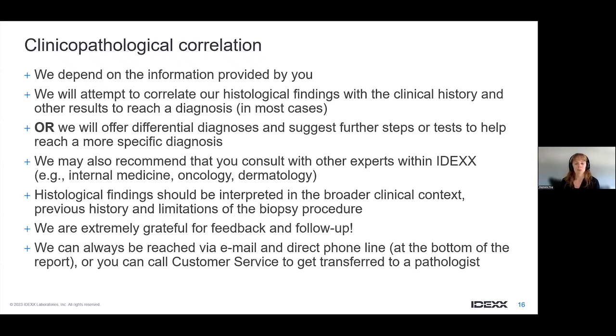We rely a bit on you interpreting the histological findings in the broader clinical context, of course. If you just submit one little biopsy of the liver, for example, it's really hard to say, is it a mass or is it a liver biopsy? Just something to keep in mind.